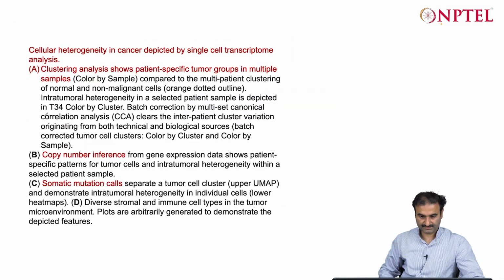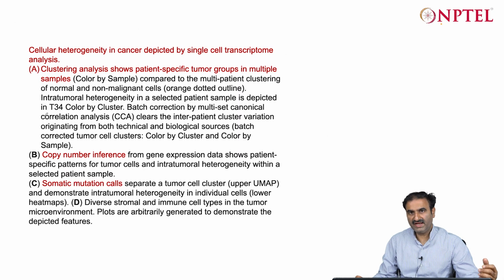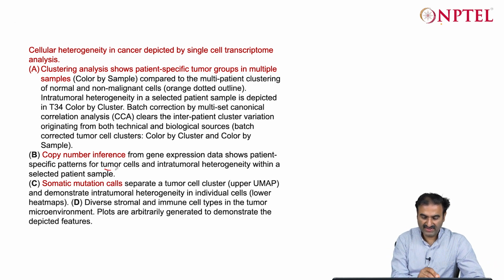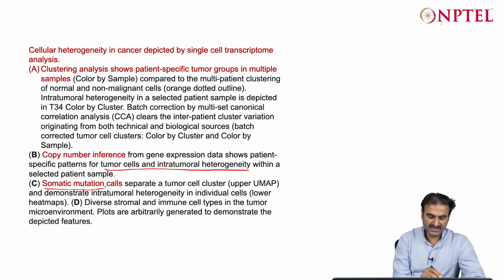From the differences in the transcriptome data, they are inferring the copy number variations in the tumor cells and the intratumoral heterogeneity within a selected patient sample, and also the somatic mutations that separate a tumor cell cluster.